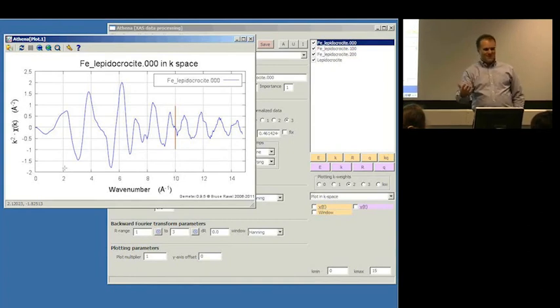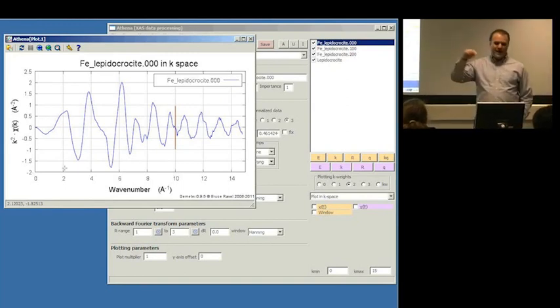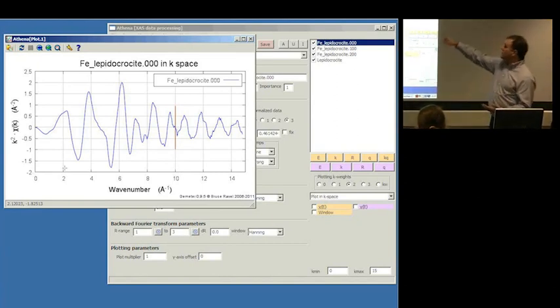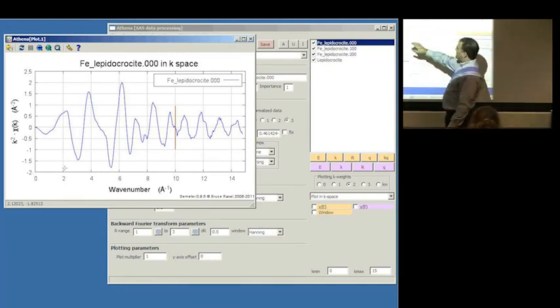Great, awesome. Then, to go from K to R, we do this Fourier transform thing, which is a mathematical function that isolates the frequencies out of an oscillatory spectrum. And you see there's certainly one big frequency, and then things like this right here indicate that there are some faster frequencies in the data.